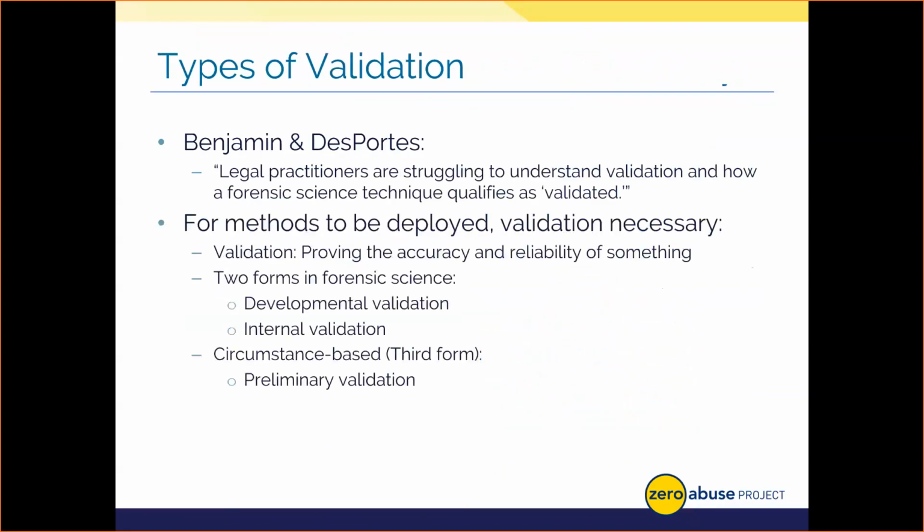I do want to talk about validation. I think it's a key component to the success of a forensic laboratory. And of all places, a criminal defense firm, I think they hit the nail on the head on validation. They state that legal practitioners are struggling to understand validation and how a forensic science technique qualifies as validated. I think that's totally true, right?